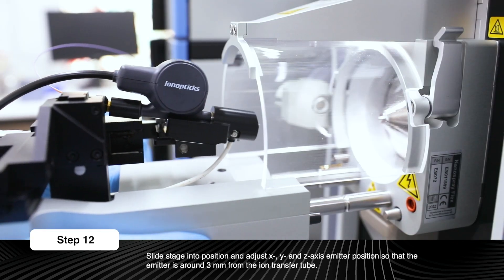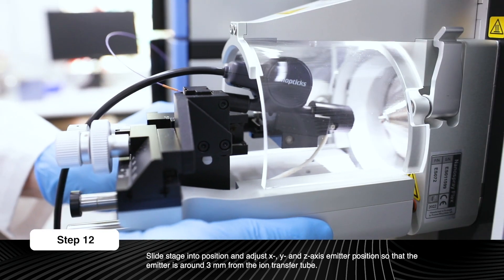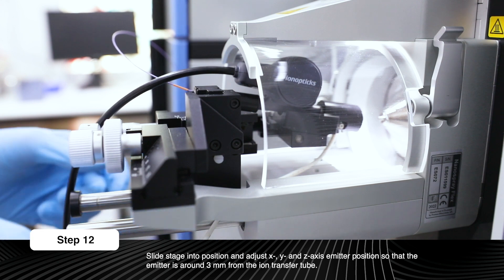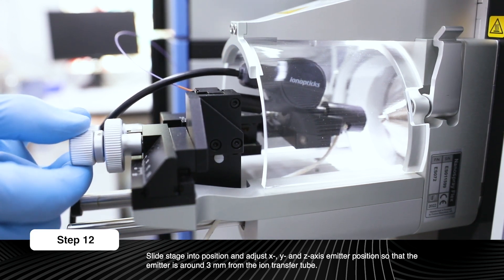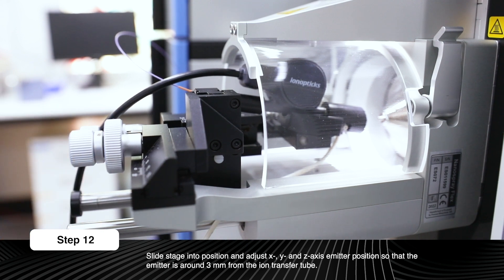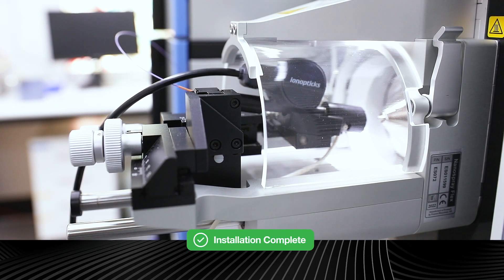Slide the stage into position and adjust the X, Y, and Z axis to ensure a good emitter position. The emitter should be around 3mm from the ion transfer tube. The column is now installed in the heater and source and ready for operation.